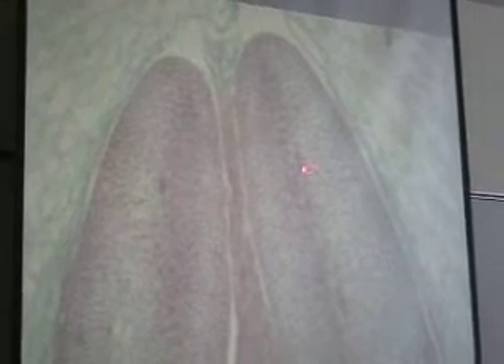Yours might be stained like this — cotyledon, cotyledon, stem tip, hypocotyl. Some young leaves are starting to form here. Stem tip, hypocotyl.